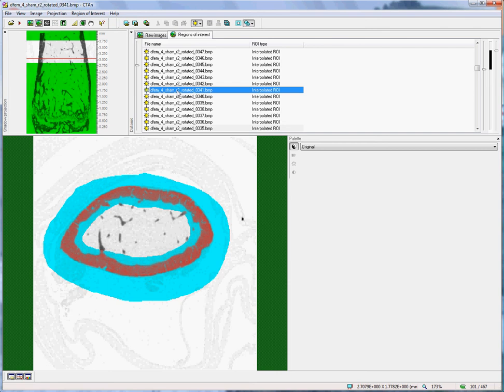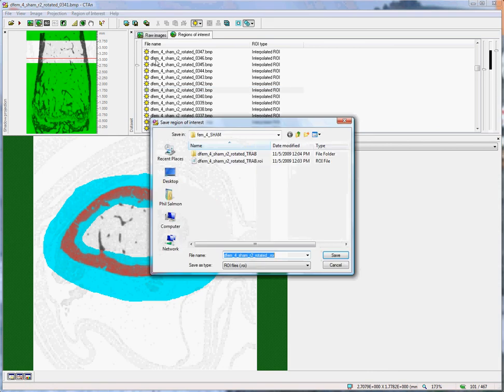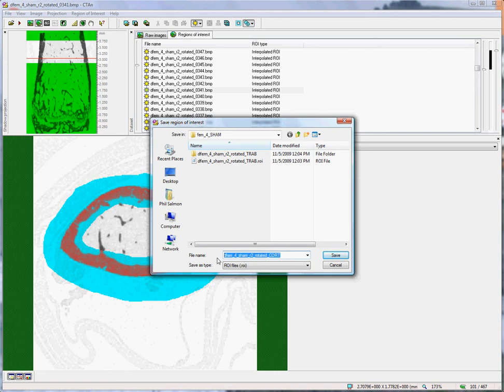Once the volume of interest has been checked, we can save it as before, clicking on the second ROI button, Save ROI. This time, we will name it CORT, or Cortical.